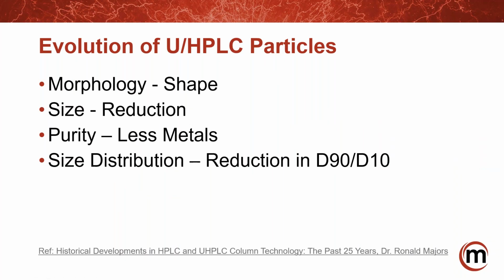So when we talk about monodisperse fully porous particles, you sort of want to go into the history of how HPLC particles were designed. And it's a fairly long history. The technologies really came about in the mid-50s.